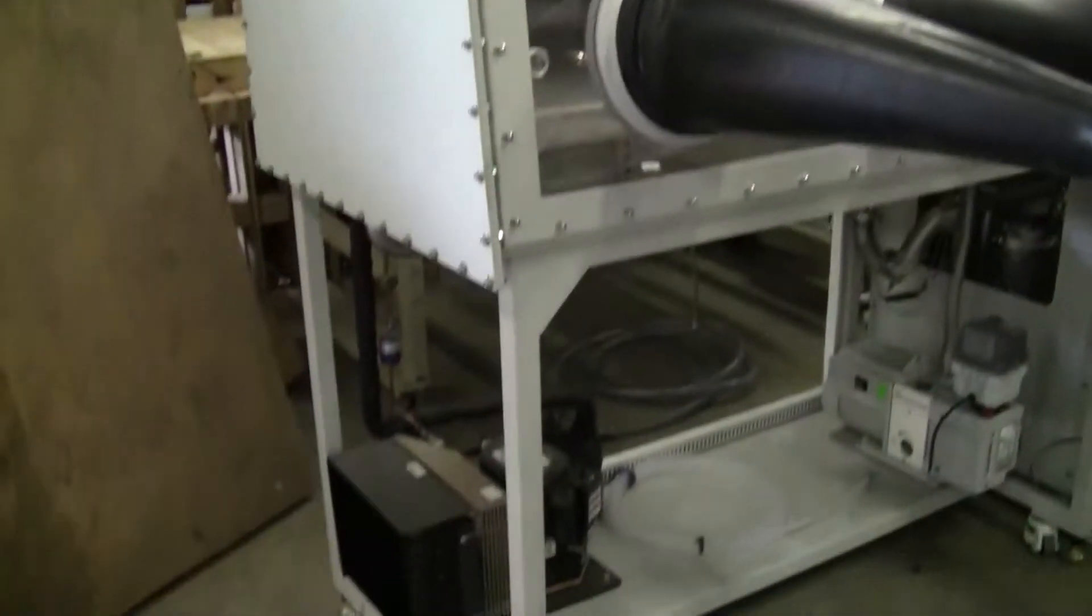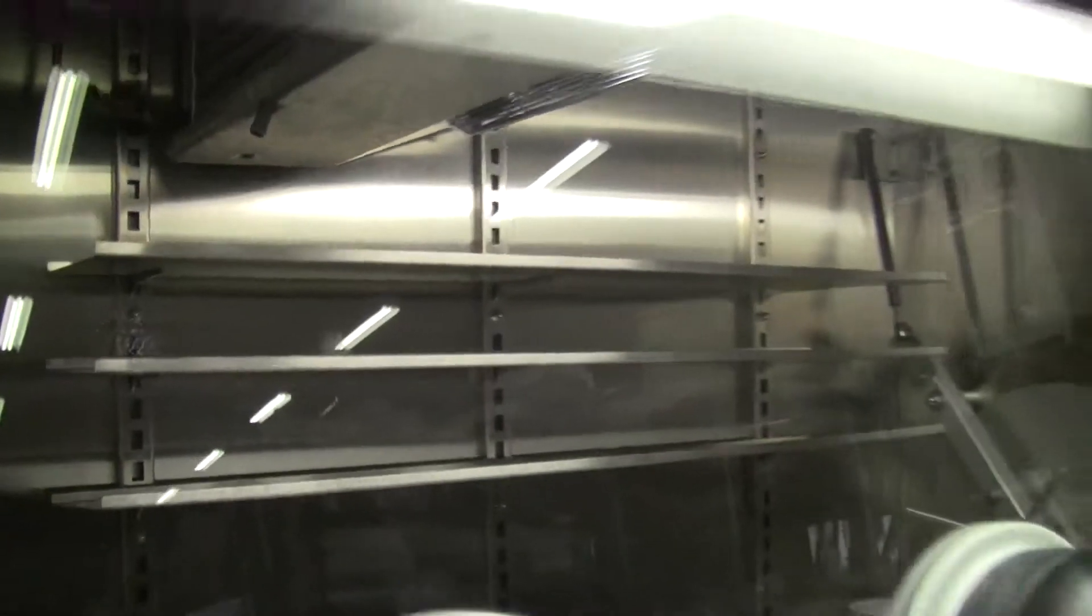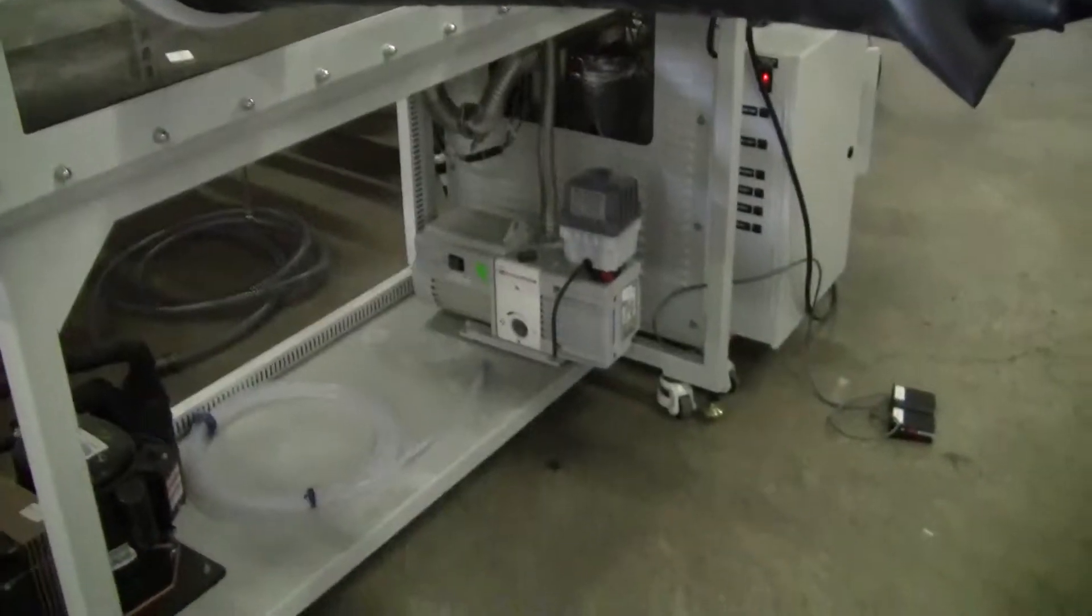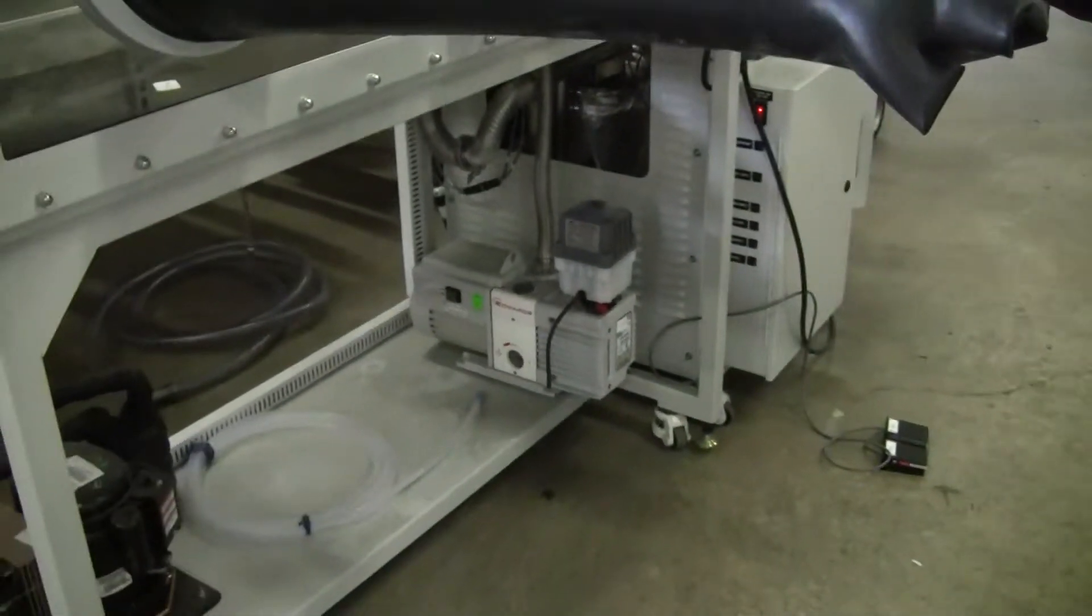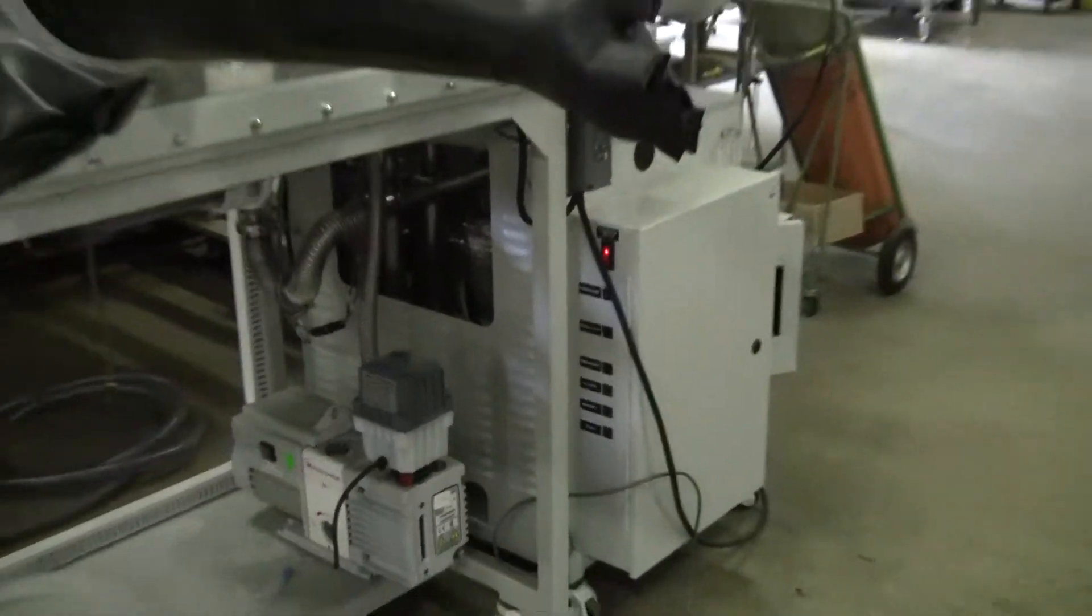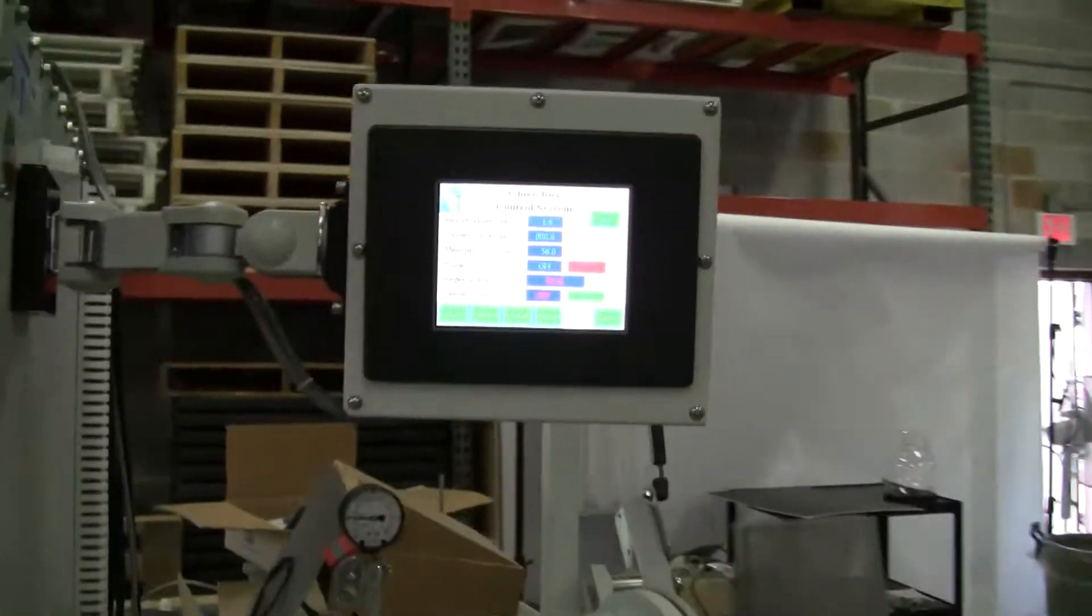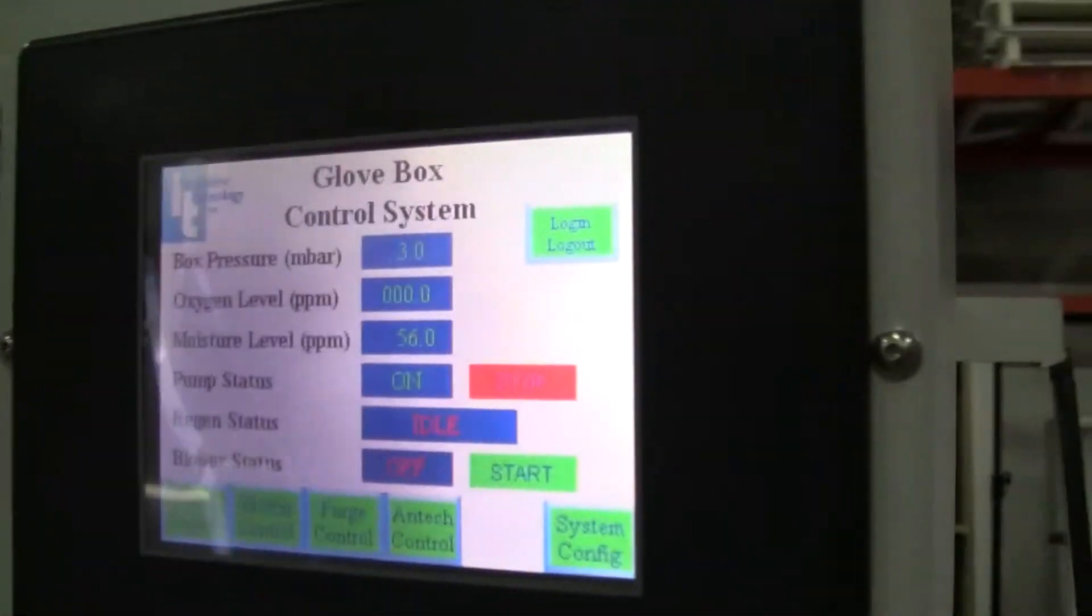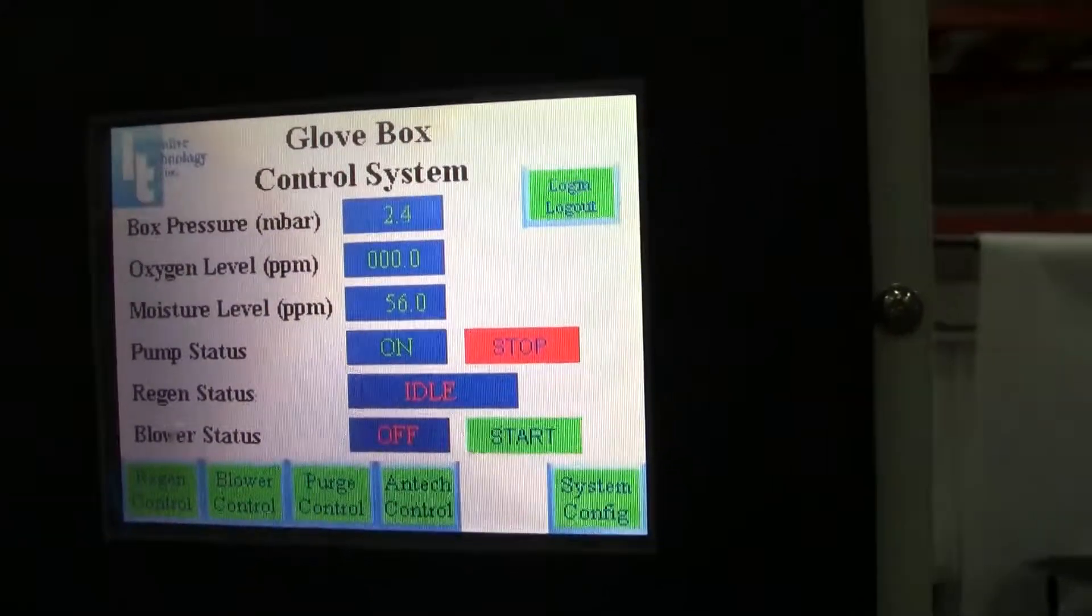This particular glove box has a refrigeration system, vacuum pump, regeneration system, and touchscreen controls.